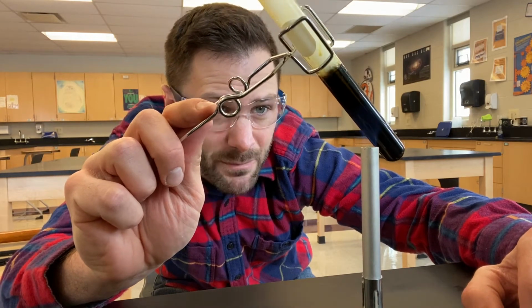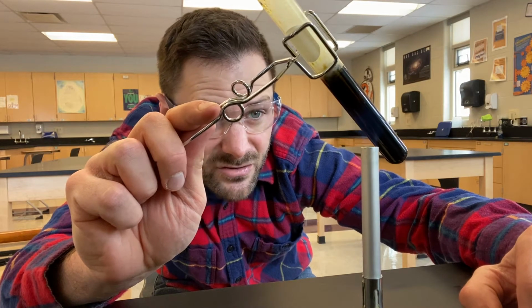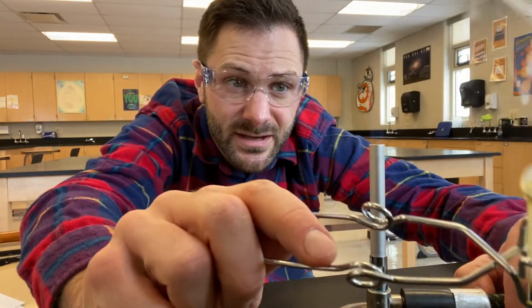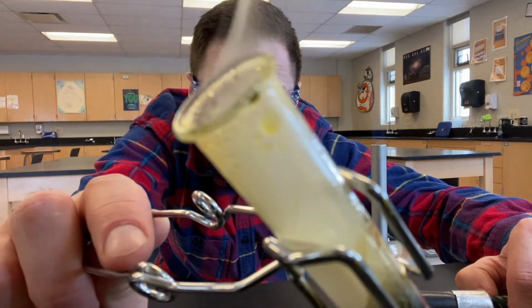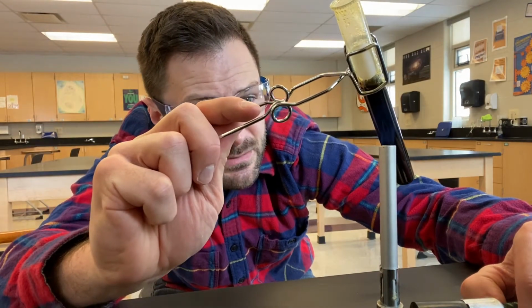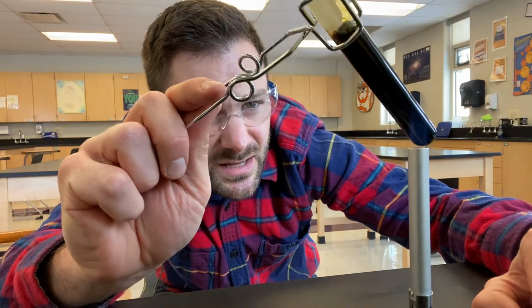And it's really not brown anymore. It's almost a dark black. If it is brown, it's such a deep brown that it almost appears to be black. Look at that smoke or fog. It's kind of turning a yellow color. See more condensation with some yellowing inside of it on the interior of the test tube. I wouldn't want to touch the test tube right now because it's really hot.